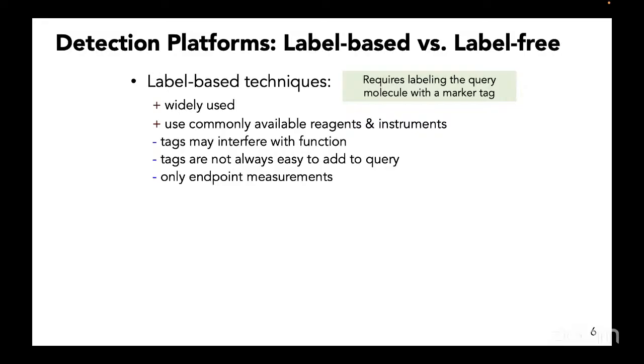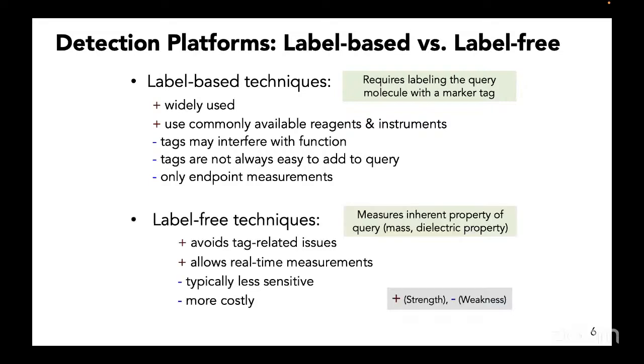We get some images from that. Only after looking at the scanned images are we able to understand whether the experiment has worked or not, right? For example, there is too much background, or there is a good signal but a lot of spillover, or the concentration is too low. Many things we only learn after scanning the slide. So we are looking at endpoint measurements, which is one of the very big drawbacks of these label-based platforms. You are doing the experiment in a blinded manner for almost 2 days, and at the end you are very disappointed that the experiment did not work out.